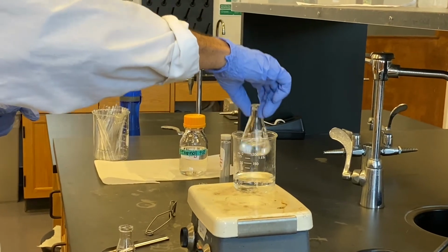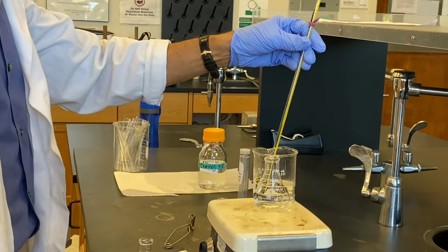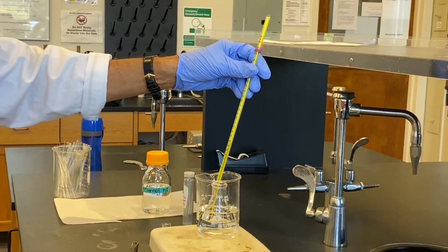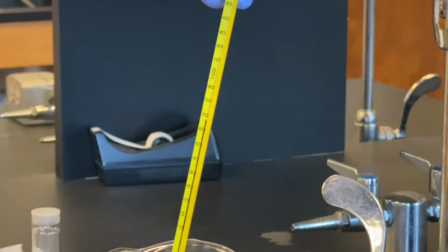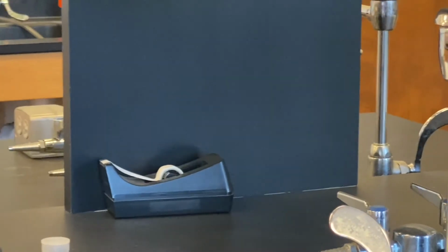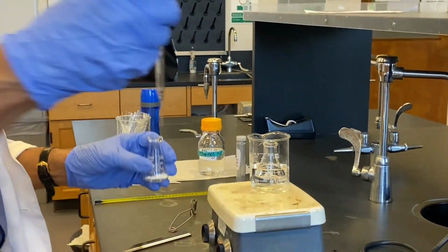So this is now already, let us see the temperature here. Yeah, it's already kind of hot. 70, yes, it's already 75, okay? So I'm going to transfer this using a 1 ml Pasteur pipette.